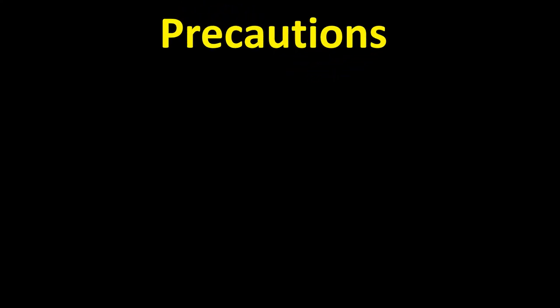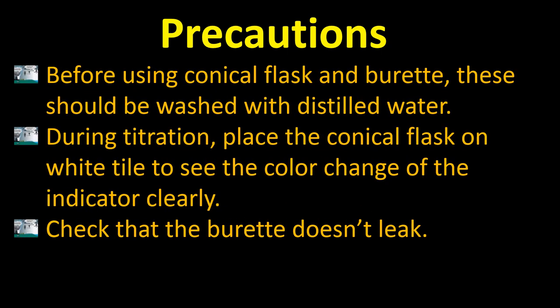What are the precautionary measures to take before or during the experiment? First, before using the conical flask and burette, these should be washed with distilled water. Second, during titration, place the conical flask on a white tile to see the color change of the indicator clearly — the white background makes the color change easily prominent. Third, check that the burette doesn't leak.